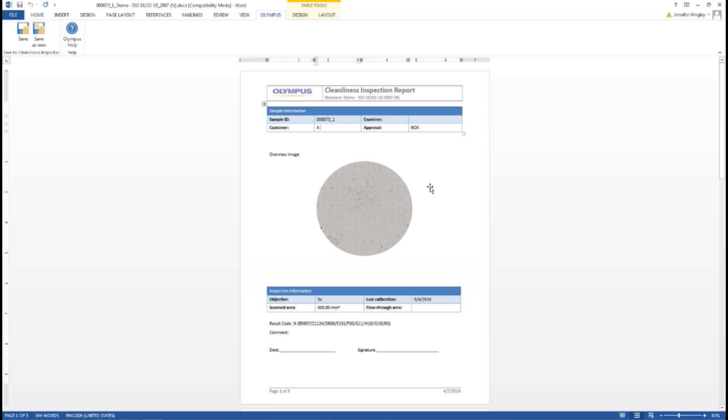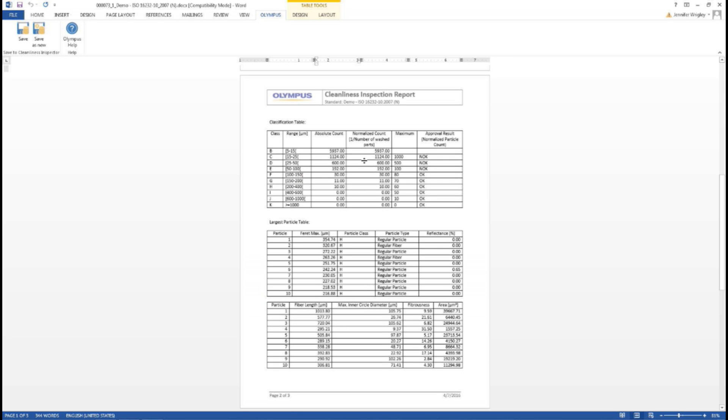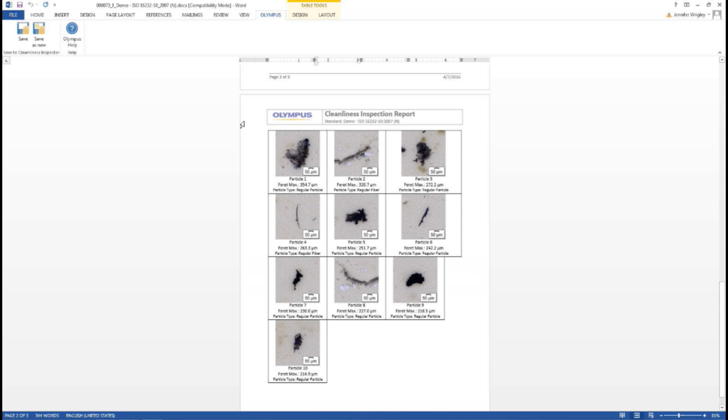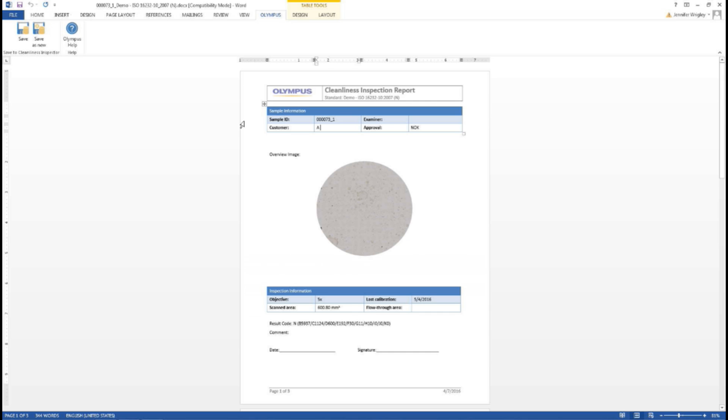The template is something you create to select what kind of information you want in there. The template will have your logo at the top, which you can adjust. All those fields entered at the beginning — serial number, part number, customer name — insert automatically if you want to show them in the report, and you can position them wherever you want. Scrolling down to page two, we have it set up to show our bin classes again, all the different particle sizing and their total counts, and it shows if it passed or failed each bin. Then we show the top 10 largest particles with all their measurement results, and further down, the top 10 largest particles in picture format. This is a Word document, so you can save it and email it if needed.